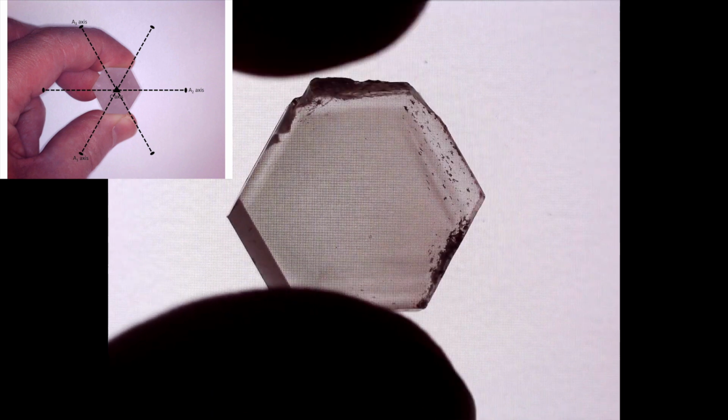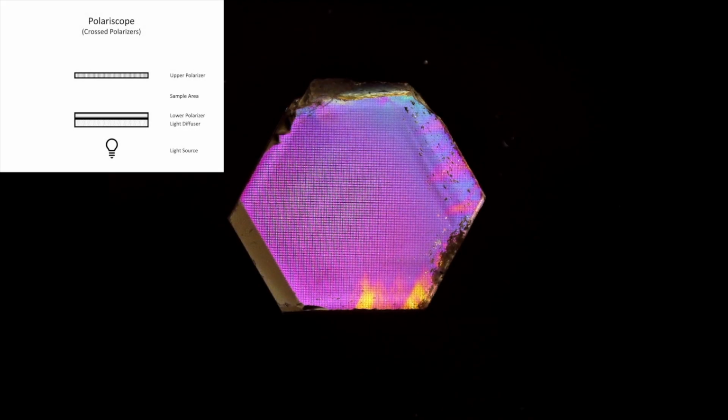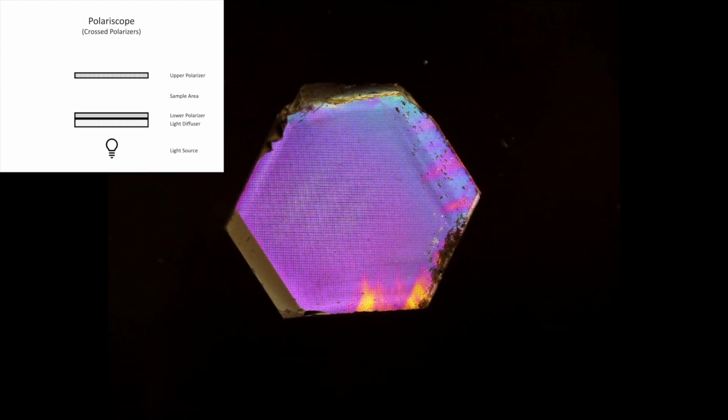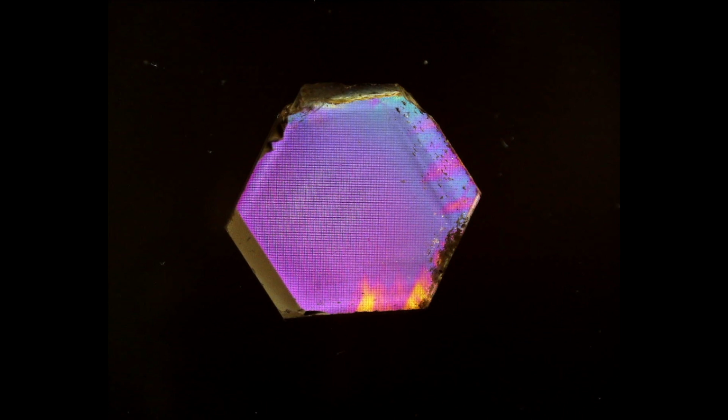Here are images of our two different pleochroic end member colors side by side, so you can hopefully spot the less than impressive difference. Let's return our smoky quartz crystal to a view where we're looking down the c-crystallographic axis, and let's check out what happens when we bring in our upper polarizer and view the sample with crossed polarizers. So just like with our rock crystal quartz slice, what we see here is a manifestation of the optical activity of quartz. In addition, along the edges of this quartz crystal, we can also see small Brazil law twins.